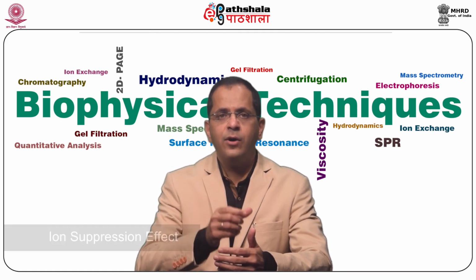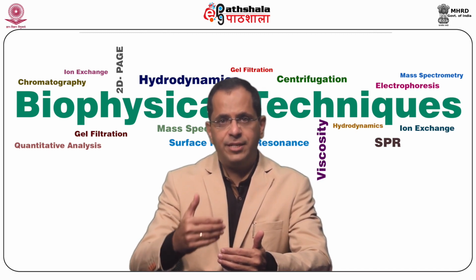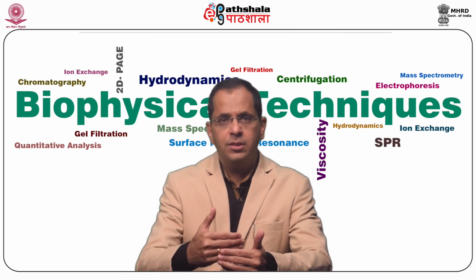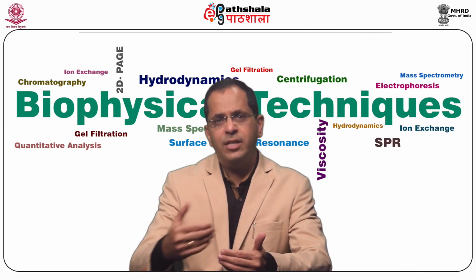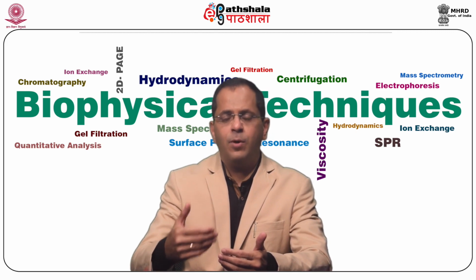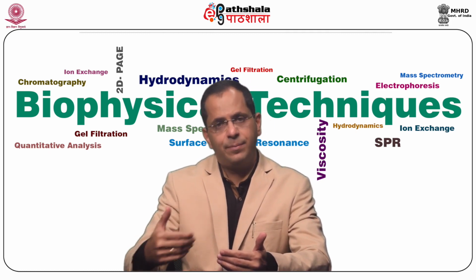There is what you call an ion suppression effect. Mass spectrometer based reduced detector response or signal to noise ratio is a manifested effect of competition for ionization efficiency in the ionization source, that is between the analyte of interest and other endogenous or exogenous molecules. Examples are plasticizers extracted from the plastic tubes, the mobile phase molecules that have been added, and the species which have not been removed from the sample matrix during sample preparation.